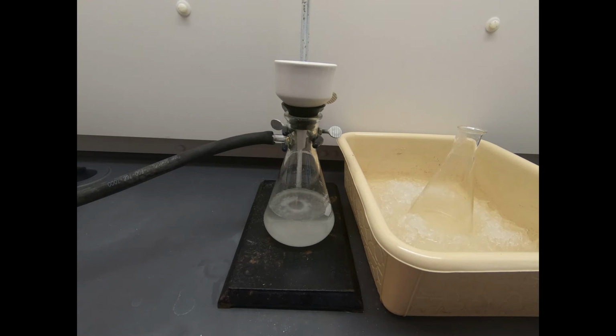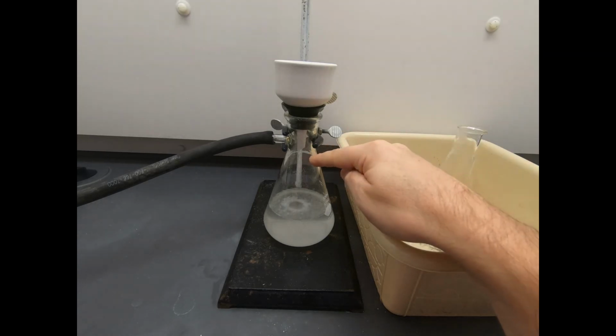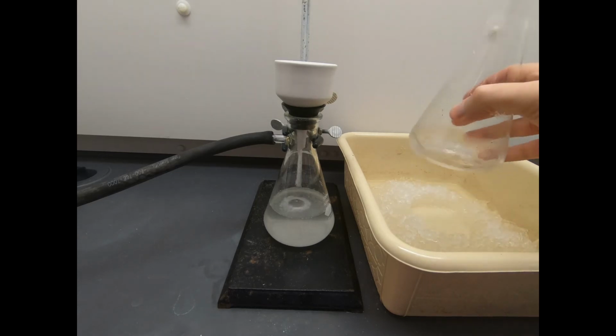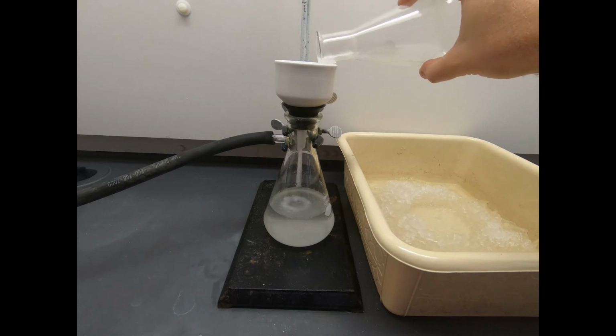We are almost done. You'll be able to just watch this dripping, and when that stops, we'll know we filtered everything through. And it is almost there. I can see from a little bit higher angle than the camera. Okay, that's kind of the end of it. There we go. Okay, that looks better. Now, let's give it a little bit of rinse.